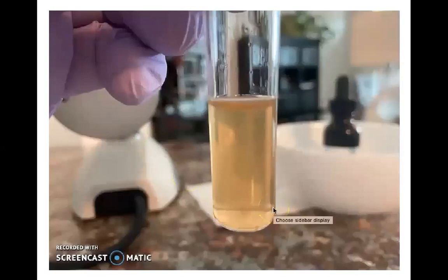Anytime you pull a broth culture out of the incubator, one of the indications that you have been successful in growing bacteria is the cloudiness that you see in the broth solution. The broth starts off very clear. You would be able to hold a piece of paper behind it and read the writing on the paper. But obviously this solution is no longer clear because it has cells growing in it.